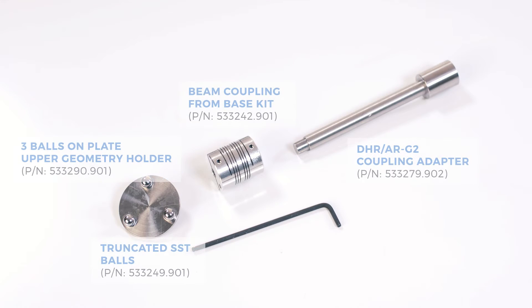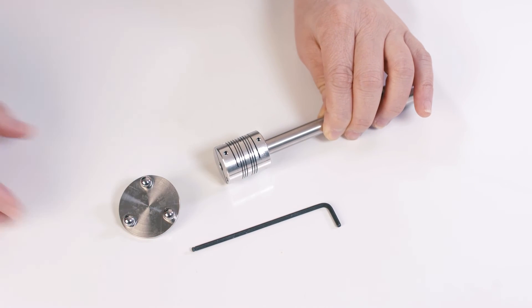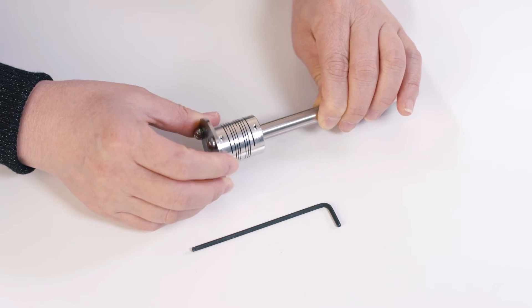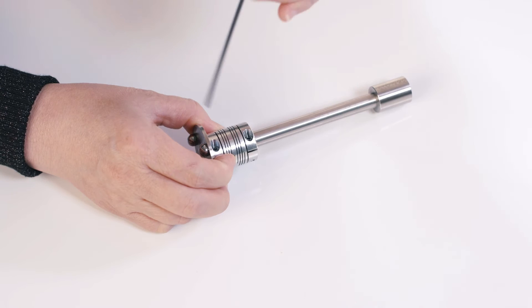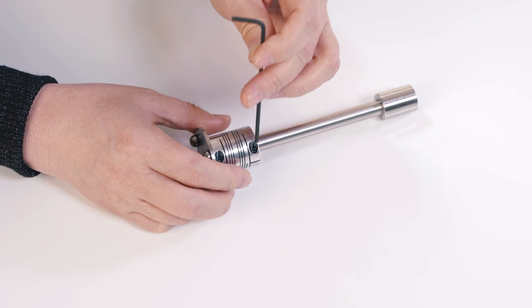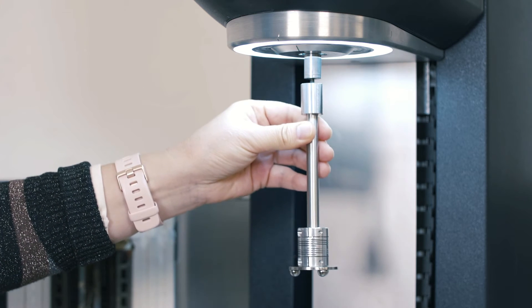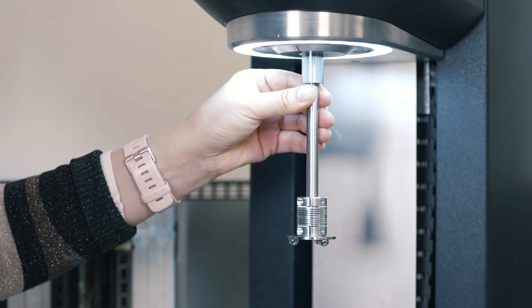For the top fixture, you will need to use this long coupling adapter. Insert the beam coupling and then attach the three ball on plate upper geometry. Users can attach all three balls or just use one ball depending on their test need. After that, install this upper geometry to the top of the rheometer.